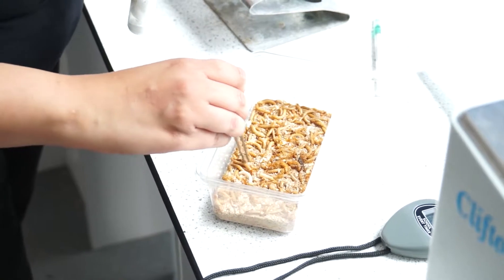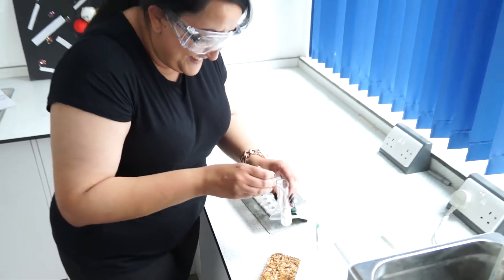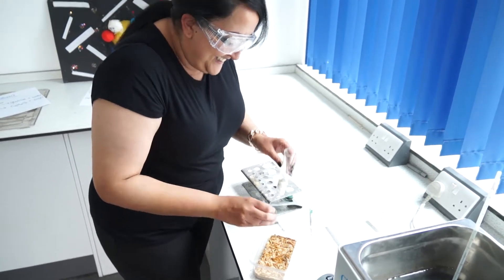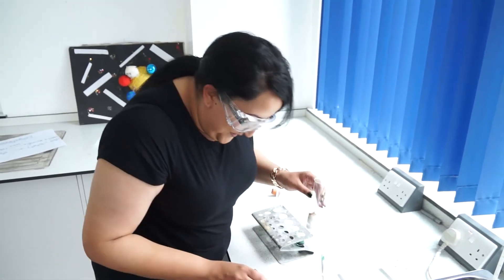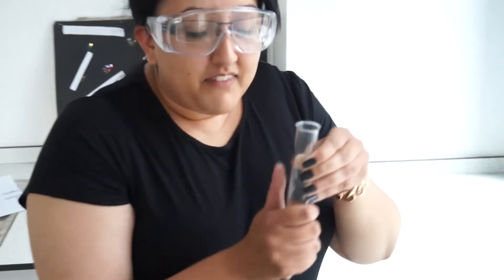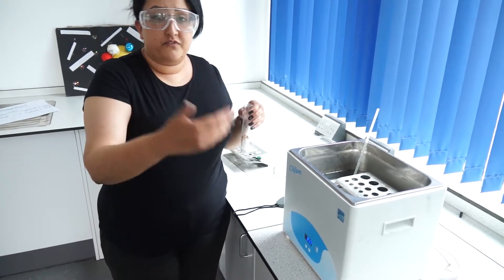You will need about 5 mealworms in there. Place them in the boiling tube and put it in the test tube rack at your first temperature. I am starting at 35°C and going up in 5-degree increments: 35, 40, 45, 50. Your teacher may recommend something else.